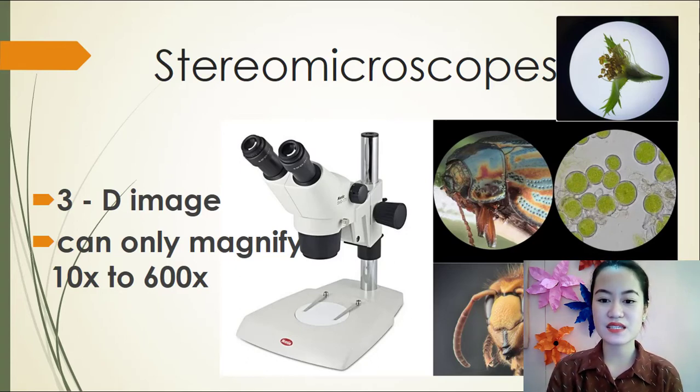Tingnan nyo yung mga specimen niya. Okay, dun sa halaman, kitang-kita niya yung loob. Okay? So, how about this one? Ayan. Itong bubuyog na to, ganyan ang hitsura niya. Sobrang linaw. Okay?